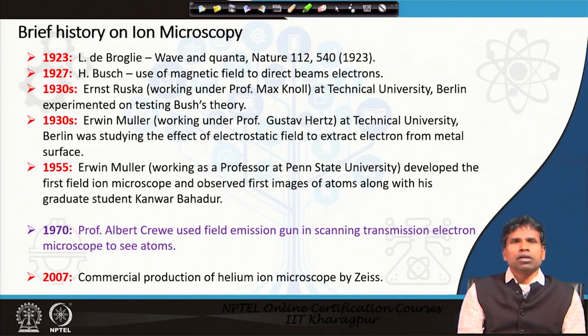Erwin Muller, who immigrated to the USA and joined Penn State University, started working on a similar area, and that led to the discovery of the field ion microscope. He is the first person who observed the image of atoms, with his graduate student Kanwar Bahadur, an Indian, and that discovery led to the present-day helium ion microscope.